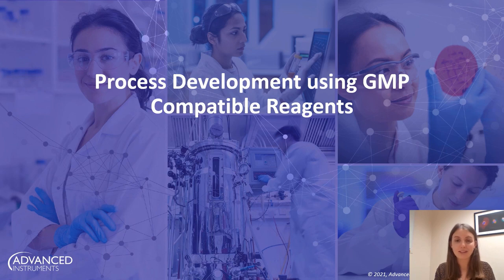Today I will be discussing with you some of our current research, and just to follow on from Ian's discussion earlier, our main focus has been investigating GMP compatible reagents and how we can implement these into our iPSC protocols and workflows, alongside using the Solentim instruments, the VIPS and the Cellmetric.